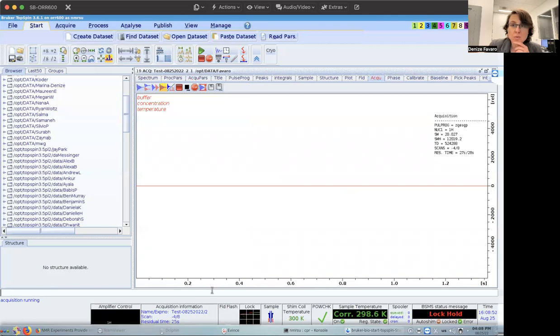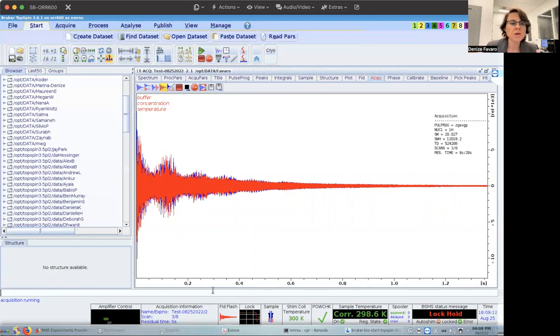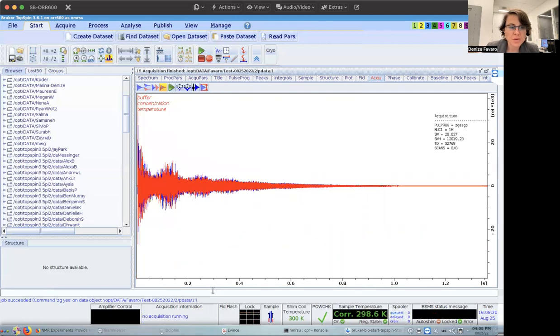That's it. You're going to see that we can compare the difference between the pulse sequence with water suppression and the one without water suppression. We can also run different water suppression pulse sequences as well, like for example ZGPR, which is another one that uses presaturation. We could use Watergate, we could use WET, Flipflop. There are several pulse sequences.